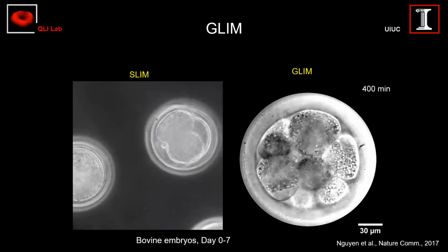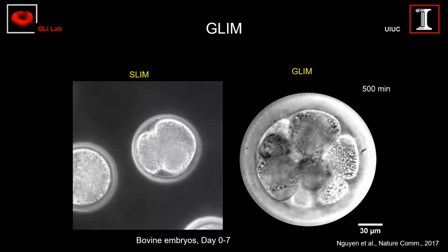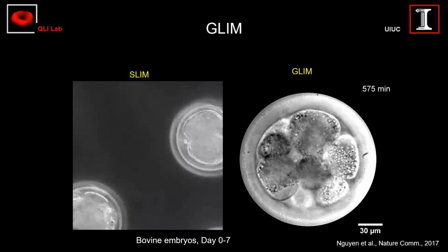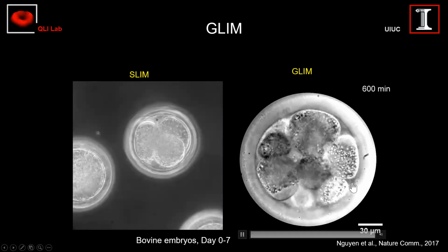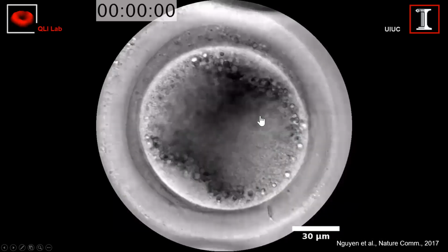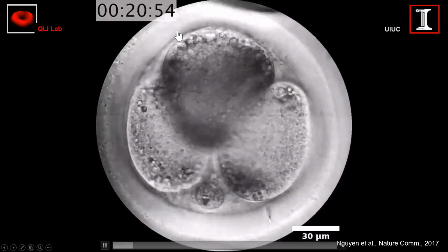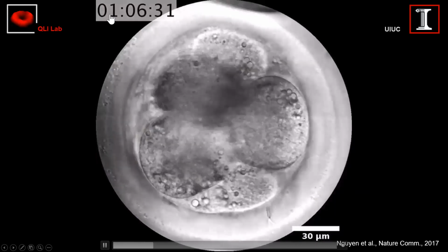So by shifting cosines into sines and so on, and subtracting 2 by 2, you subtract that multiple scattering light, that cloud light that doesn't shift, that acts as an incoherent background. And really, this is what normally covers the contrast in your image. Anyway, we're still working on the application on this. So we can now image embryos over many days.